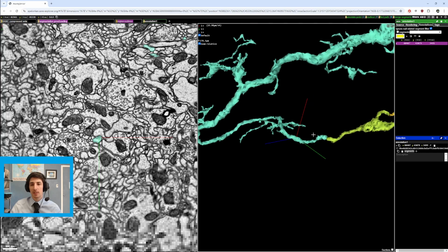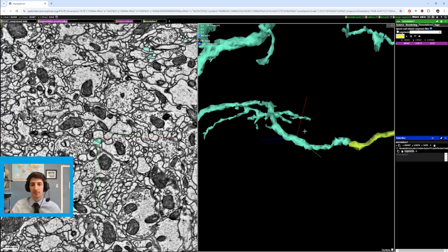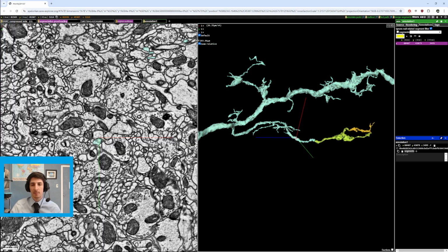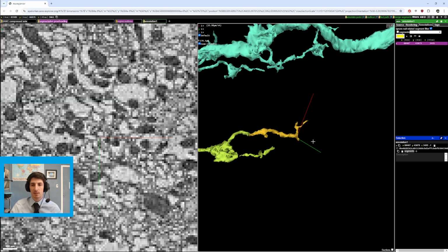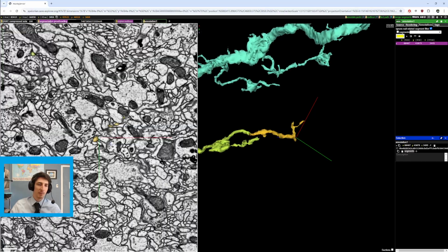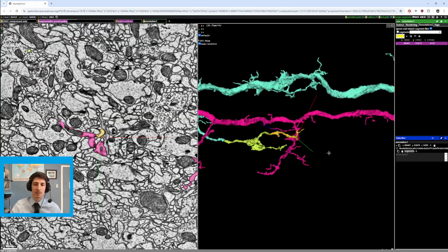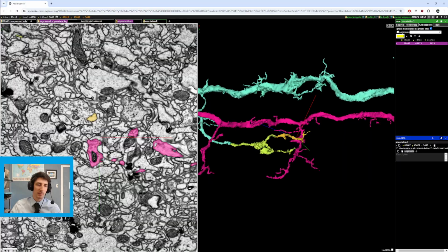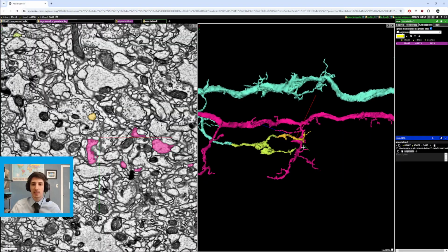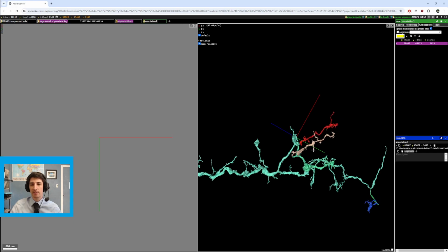Now, one thing you're going to want to do is look for branches kind of like this, of, I'd say, medium to small thickness, and you're going to want to trace them out as much as you can. Now, we can go over where exactly you're going to want to trace this. This traces into a merger, which is fine. It looks like a small bouton there. That could be salvaged. But as you can see, I've gone to a few places.